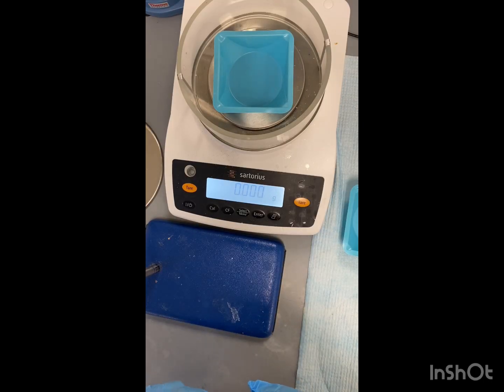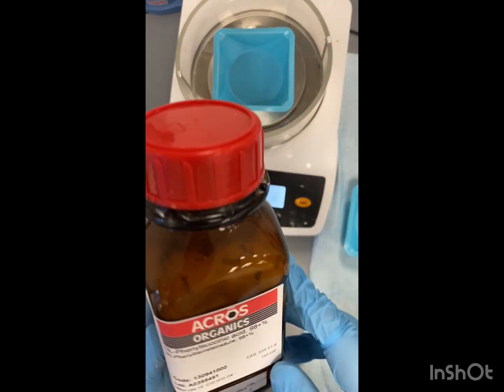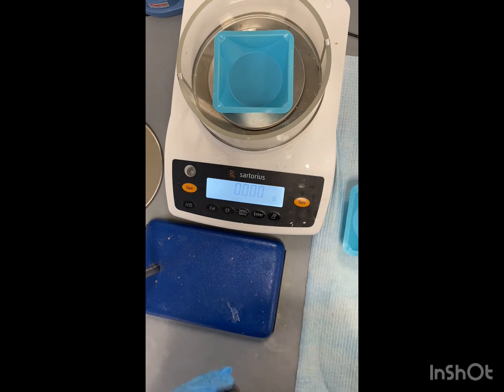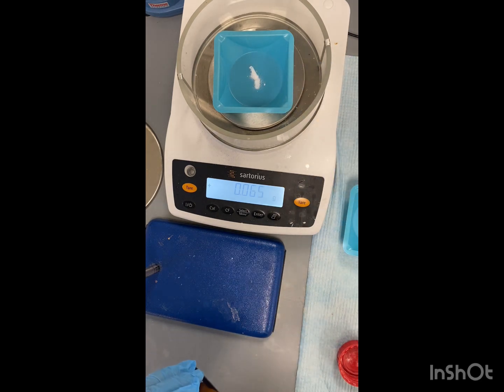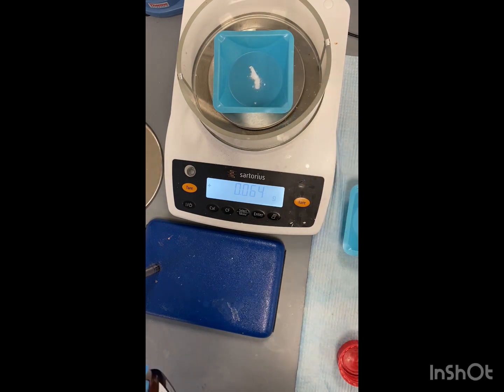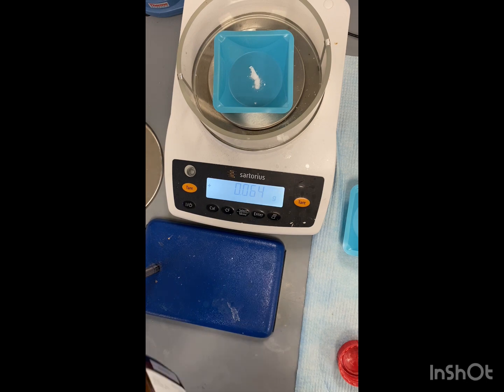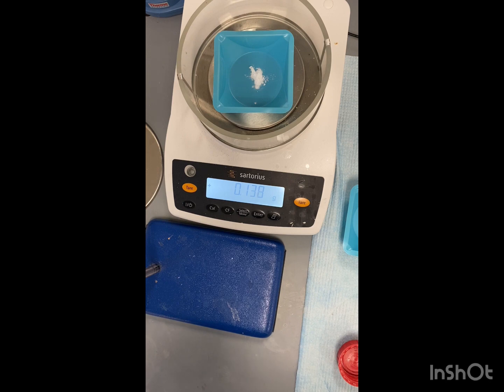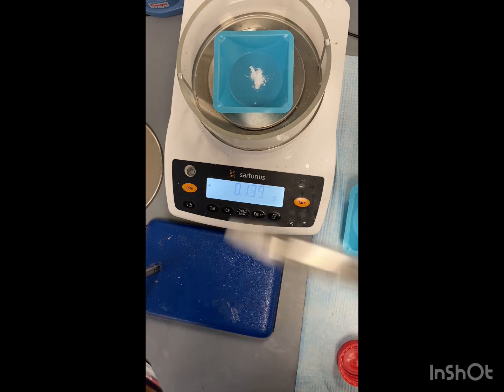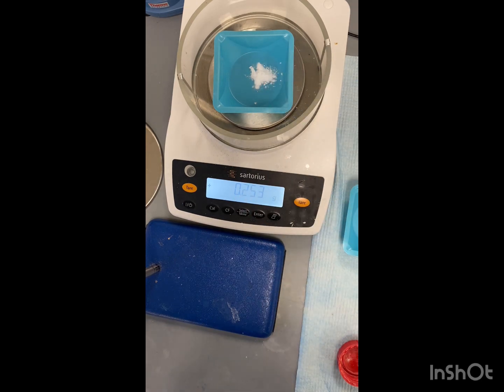Alright, so first we're going to add one gram of racemic phenylsuccinic acid. So here it is. Again, we're going to add about one gram. I already have my weigh boat on the scale and it's already tared.